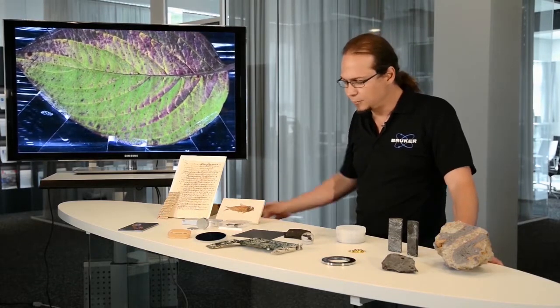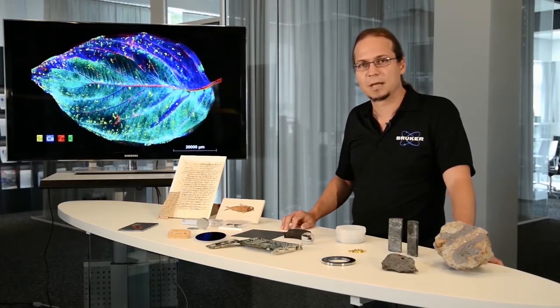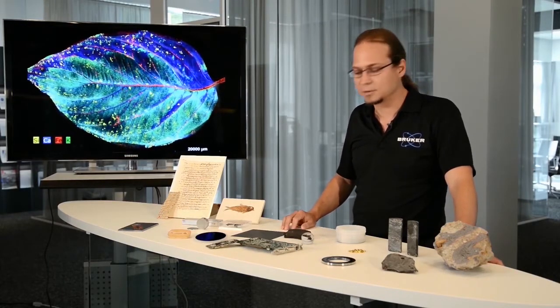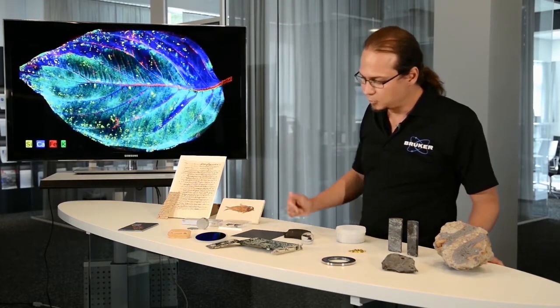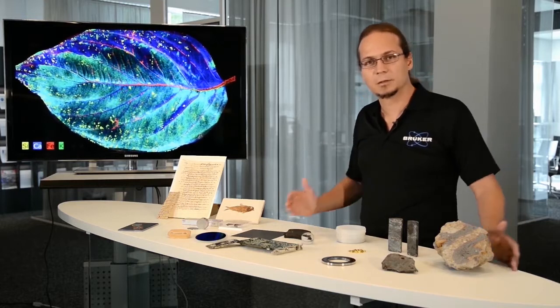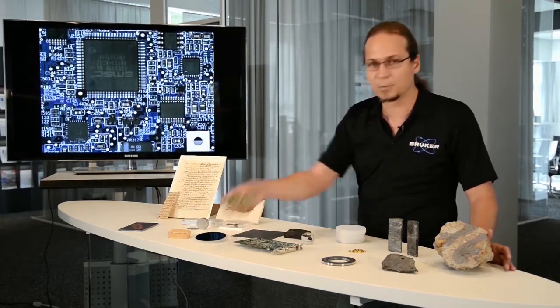And I hope I could give you just a brief introduction or an idea that everything could be a sample that can be measured with X-ray fluorescence, and especially with spatially resolved X-ray fluorescence. And after the measurement, you have on one side the data with the composition information of the sample, on the other side you have the sample as it was before.